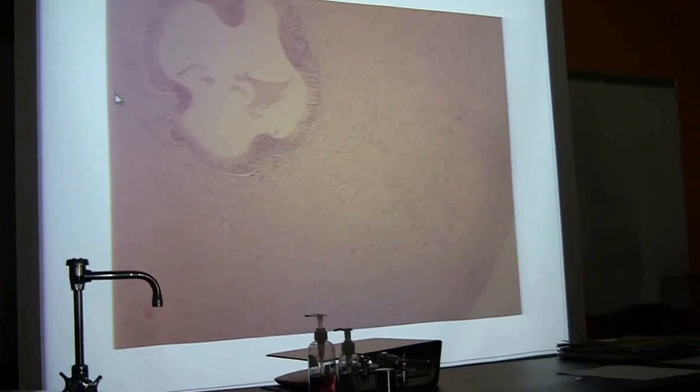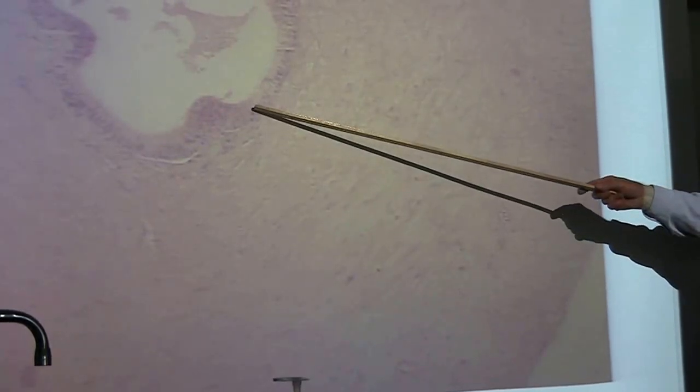So type of tissue, smooth muscle again; arrangement, longitudinal, circular, longitudinal. And again, if I'm giving you the whole wall, it's up here, that's the lamina propria and the epithelial lining. It's longitudinal. In the middle, we've got muscle on either side, it's circular. On the outside, longitudinal.